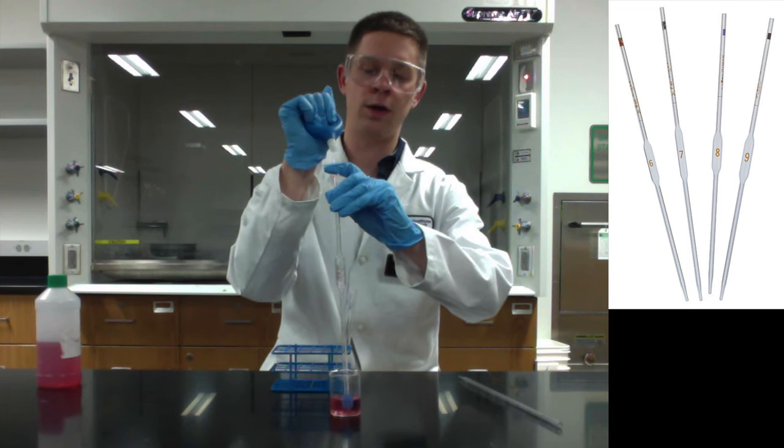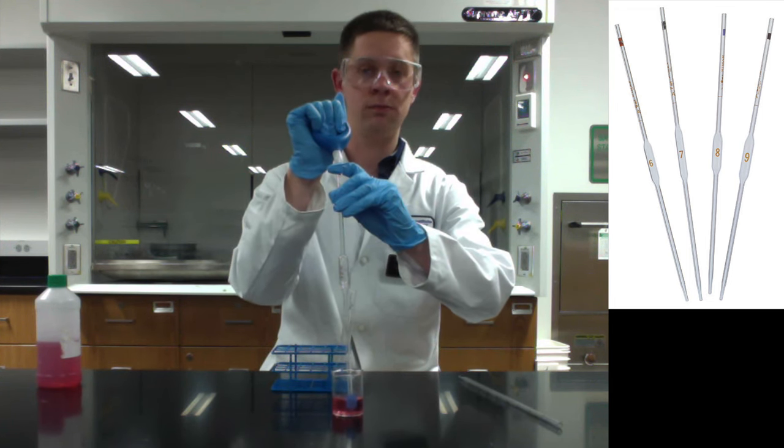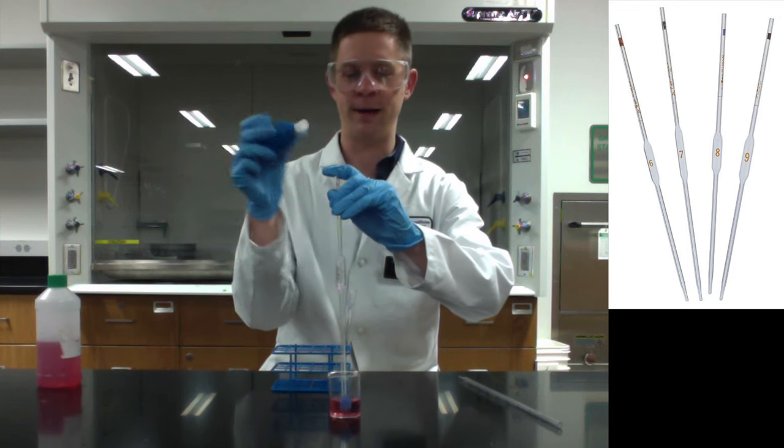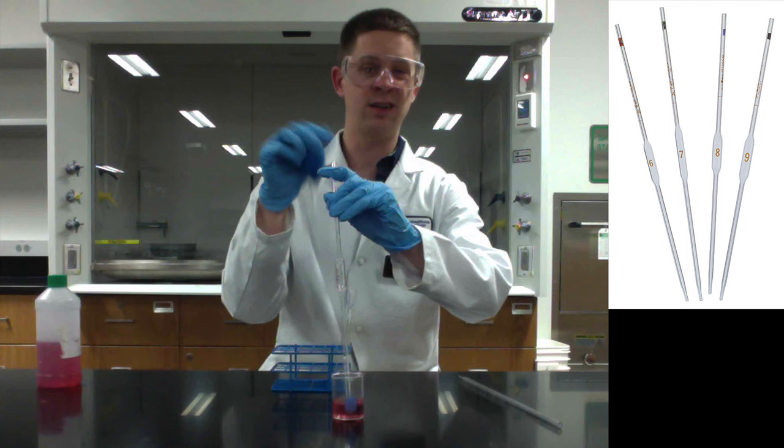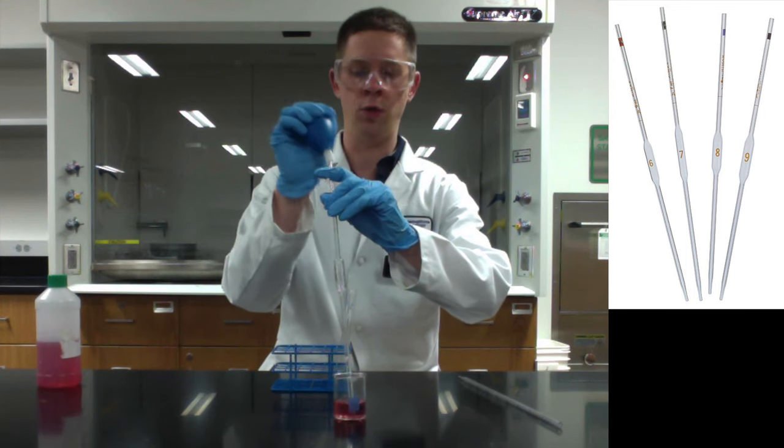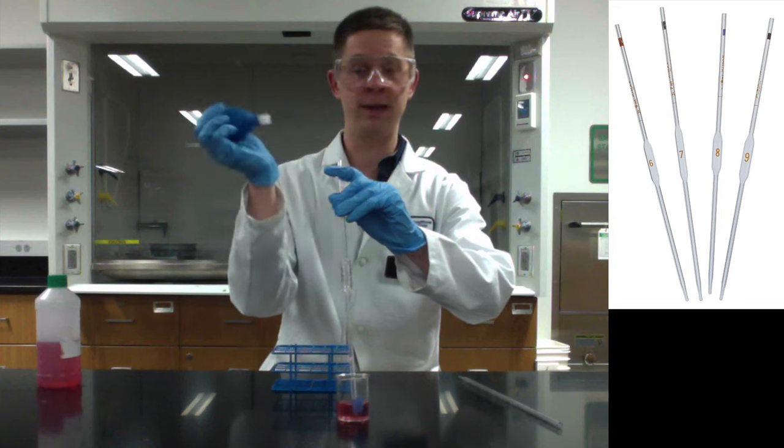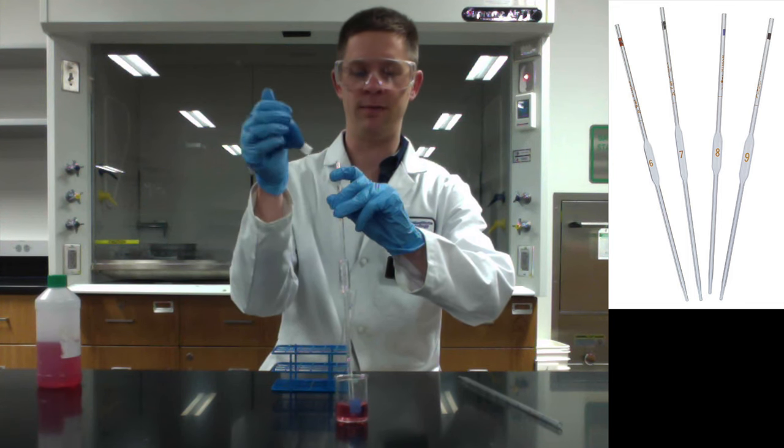Squeeze the bulb first before it goes onto the end of the pipette, and make sure, by the way, that you have a little plastic piece on the end of the pipette bulb. Otherwise, it'll get stuck on the end, and that's not actually what you want. You want the ability to put on, to seal, and remove this, to break the seal at the top of the pipette very quickly.